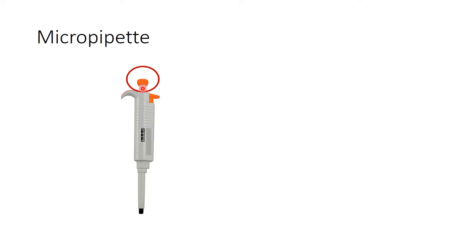This orange colored part is known as the plunger. This plunger serves two important functions. First, by pressing the plunger we can aspirate or dispense sample. It has two stages of resistance, just like a jitter pin. The first stage of resistance is used to aspirate the desired volume. The second stage is used to dispense the last drop in the tip.